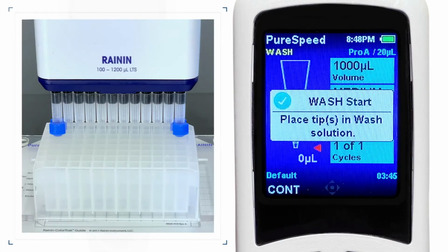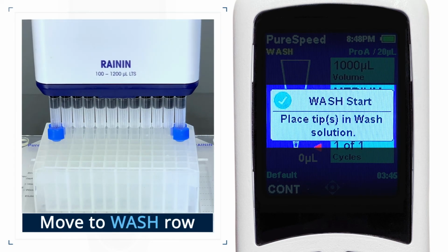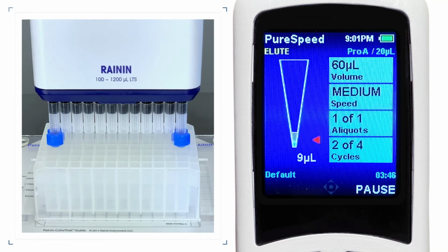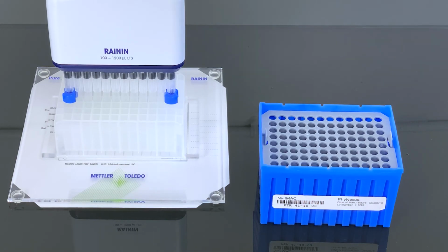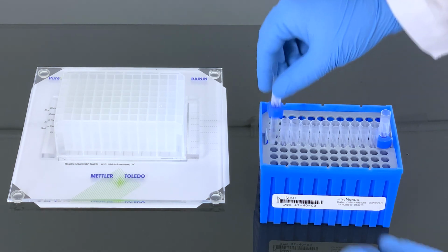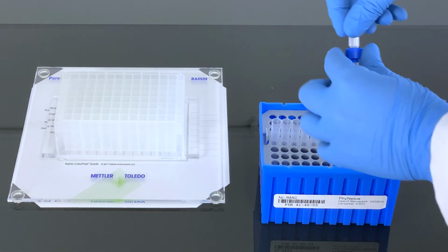Once capture step is complete, then you will be asked to move the tips to the wash row. Then elution row after that. When the entire method execution is complete, you will be asked to remove the tips. Remove the pipette from the deep well plate. Then remove the adapters from the tips and dispose the PhyTip columns.